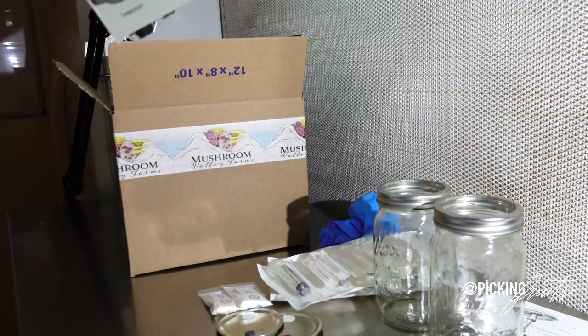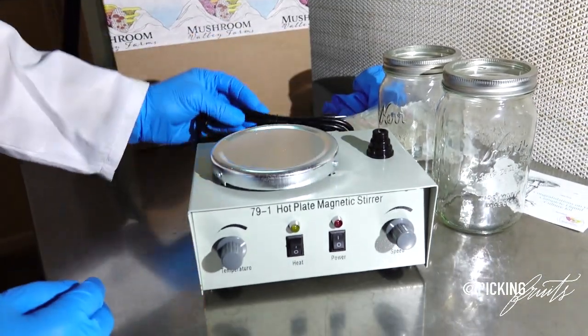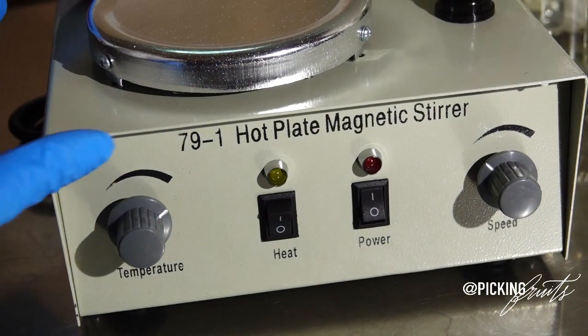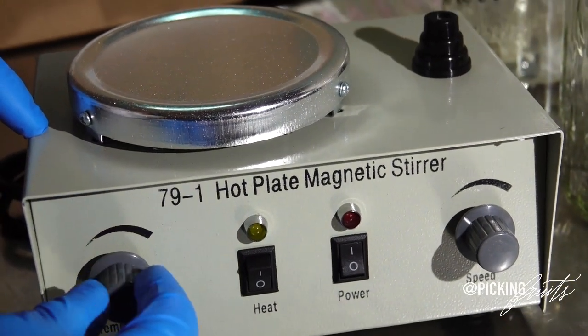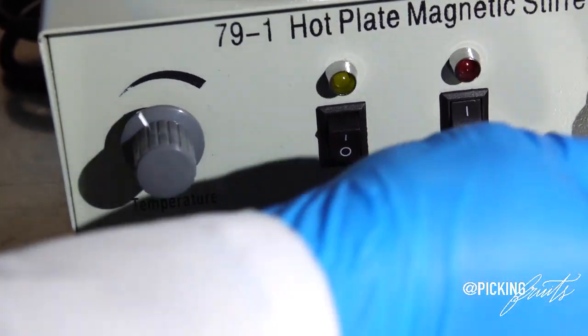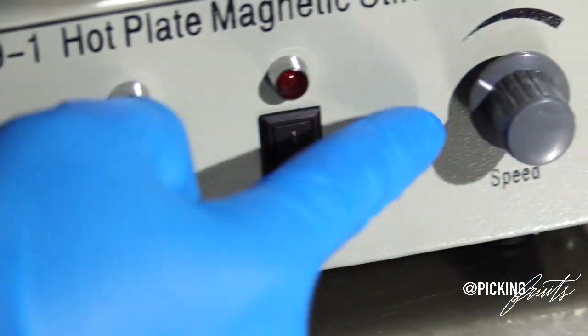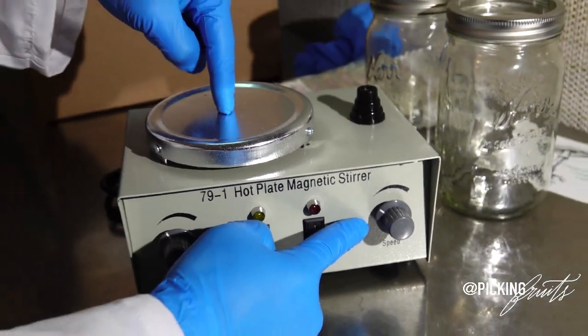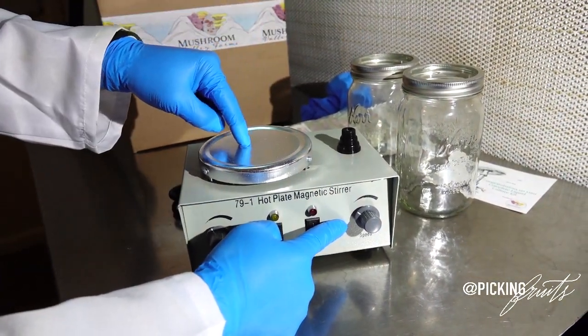And last but not least you will find your magnetic stir plate. This magnetic stir plate has nice thick steel gauged casing on it. It has a temperature control knob with an on and off switch. And it also has variable control for your RPM speed that will control how fast or how slow your magnetic stir bars spin inside of your mason jars.